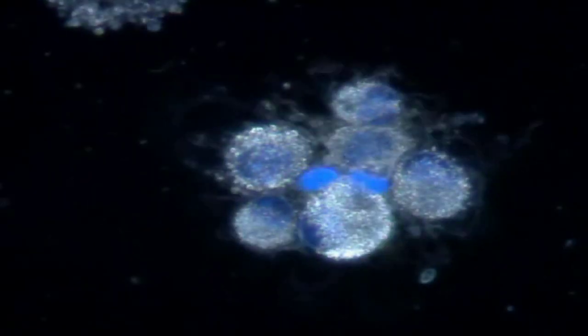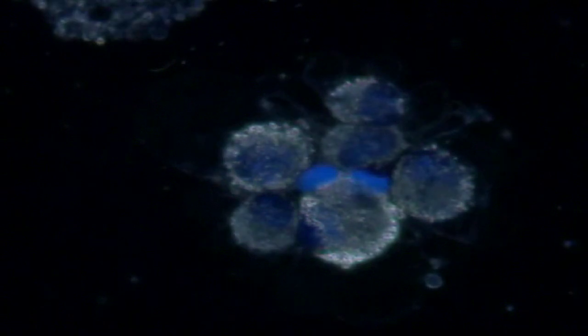These are neutrophils dying under the microscope. Notice the white components leaving the cell. The harmful effects of the fluorescent light probably add to this destructive process.